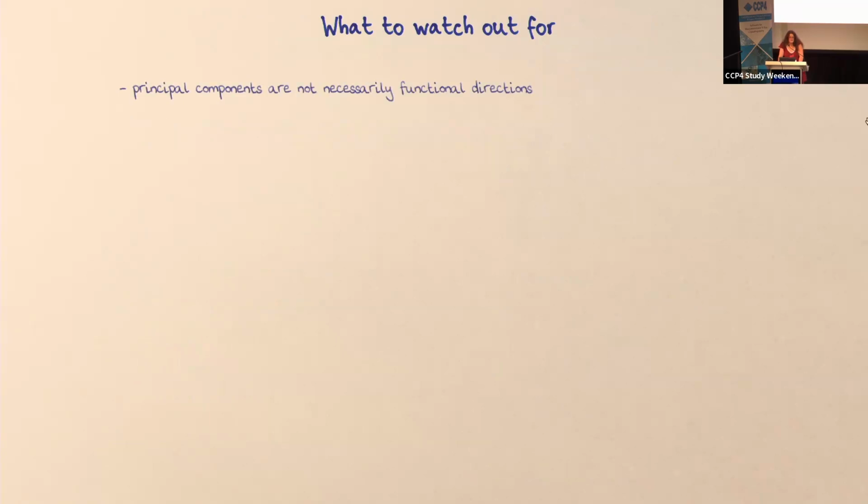Now that I've covered what it does, I just want to quickly cover what to watch out for. So principal components are not necessarily the functional directions in the protein structure. For example, if you've collected a bunch of points with a boundary condition between a high condition and a low condition, singular value decomposition will give you the axis with the highest variance, which is along the horizontal. That's not the same as the functional axis, which is perpendicular to the boundary there. So that's the correct functional axis, but SVD isn't going to give you that.